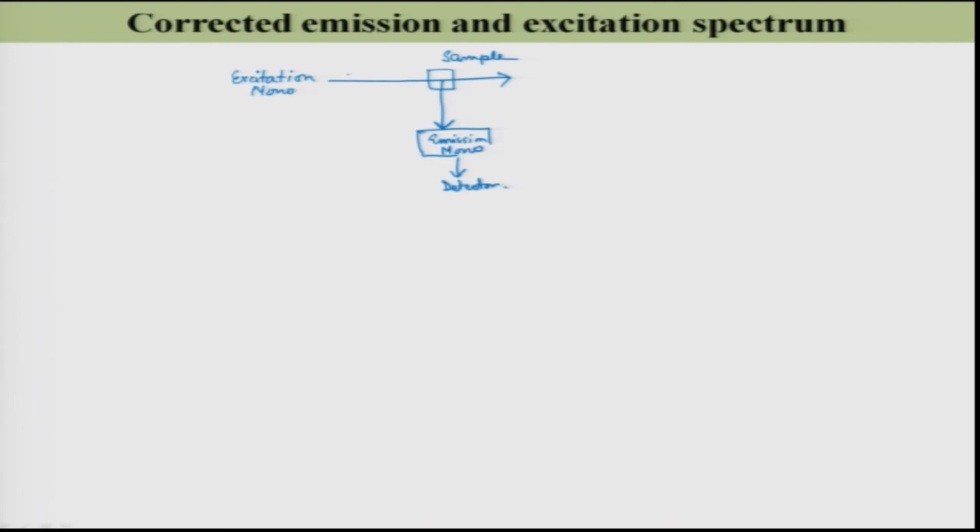As I said, you already have a reference channel over here. This is my reference detector, and I named this detector as S1, I named it as R1, right, the simplified version of that complicated fluorimeter.